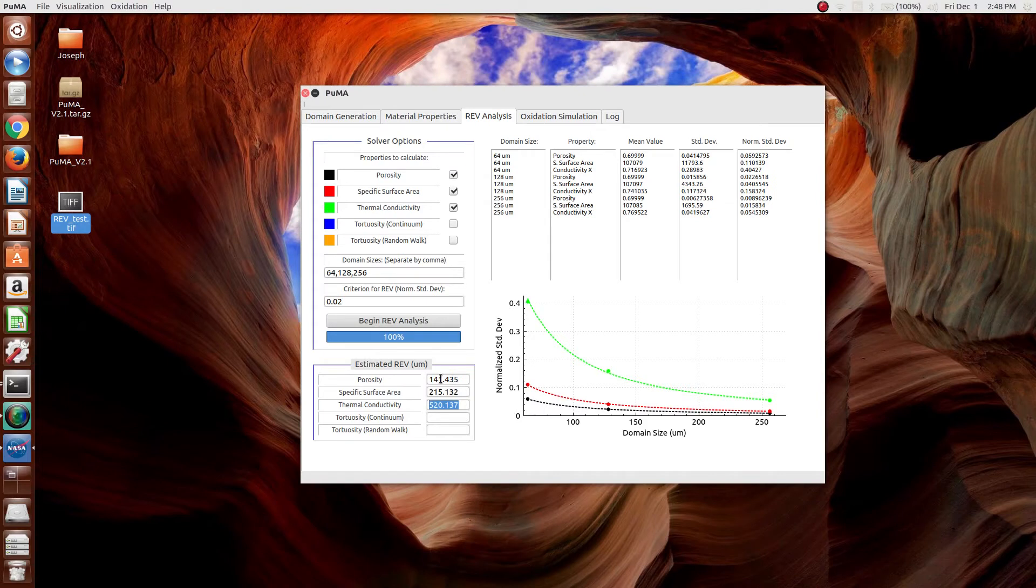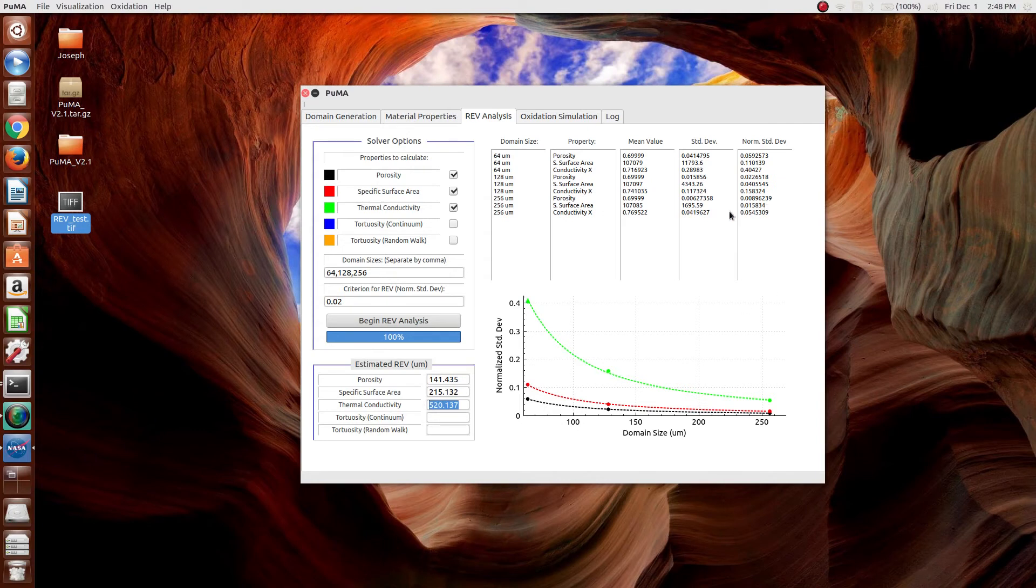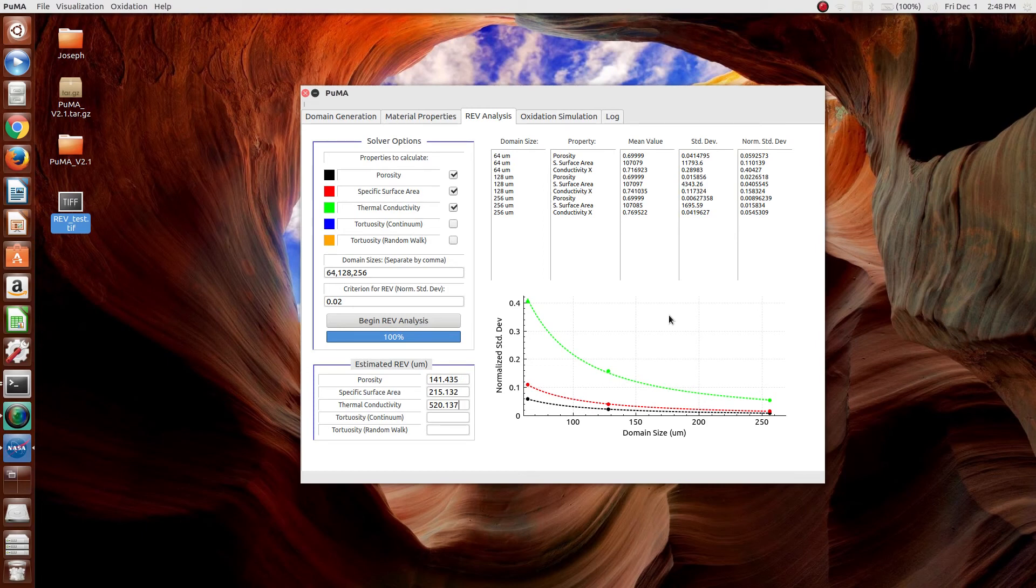The interpolations can be taken with a little bit more confidence. What this tells you more than anything is what the uncertainty is at this size. And that pretty much concludes the representative elementary volume analysis aspect of the PUMA software.